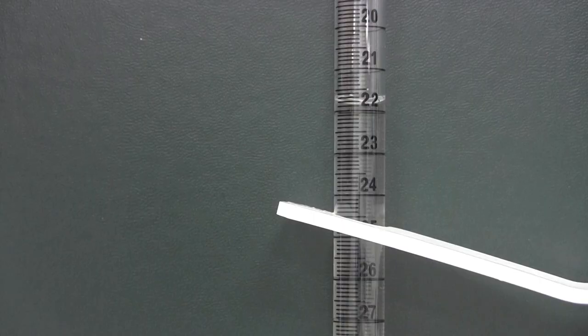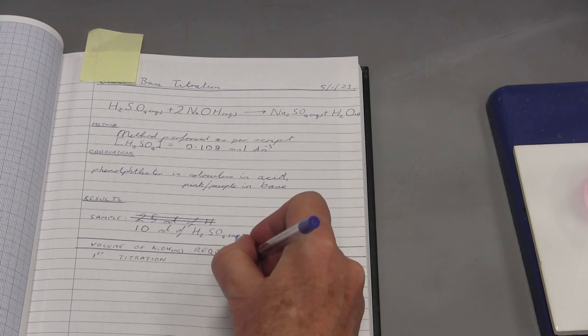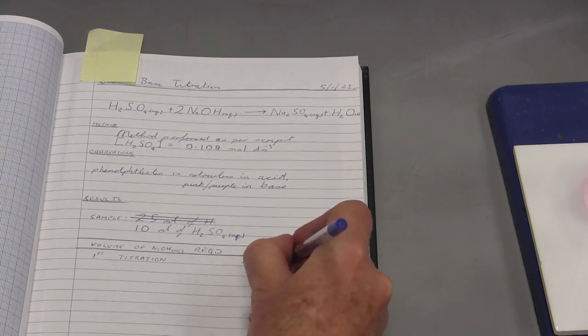The volume is read from the bottom of the meniscus. Note that the scale increases going down the burette. Here the volume reading is 21.85 millilitres. The most common burettes, like this one, have graduations every tenth of a millilitre. By eye, we can estimate when the liquid level is halfway between graduations, but not more precise than that. This means that the maximum precision of our readings is 0.05 millilitres. This reading is recorded in the lab notebook.